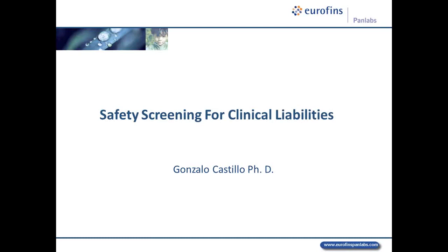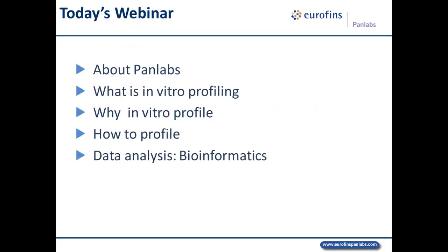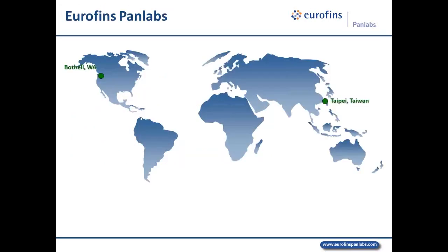Thank you, Andrew. And thank you very much for giving me the opportunity to talk to you today about safety screening for clinical liabilities. What I'm going to do today is split the presentation into 5 different areas. The first one is going to be, for just a couple of slides, what we do. Then I'm going to move into what in vitro profiling is, because that is the major activity that we do in our services, and why it's so important to do in vitro profiling and how to do it. And I'm going to finish with ways to analyze pharmacological profiling using tools like bioinformatics.